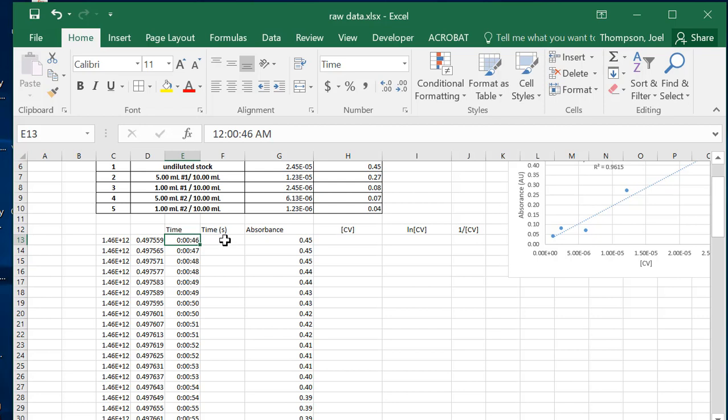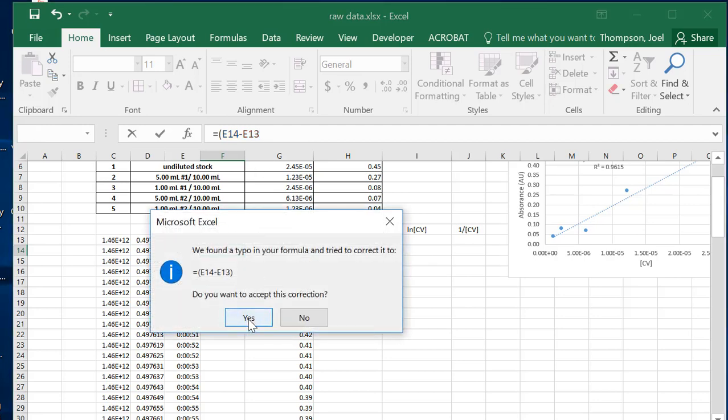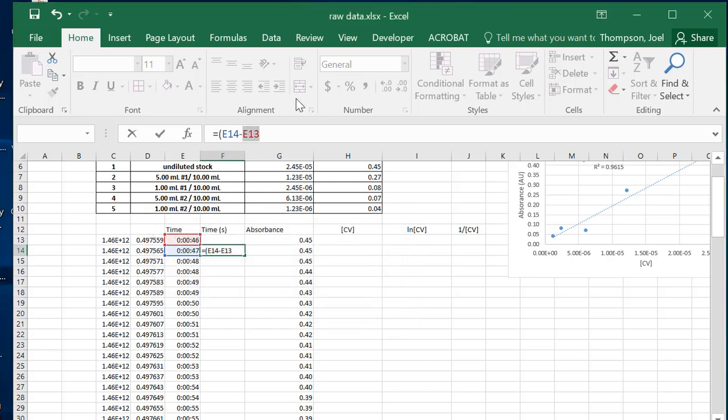So here's what I'm going to do. I'm going to subtract this time. This is a good trick, and you'll learn these things working with time in Excel. It's nice to know, especially if you want to watch elapsed time. I just want to know the difference. So in theory, from here to here, 1 second has elapsed. So I'm going to do the difference. See what I'm saying up here in my formula? The difference between here and here. Okay, there we go. And then I'm going to multiply it by that multiplier, 86,400. Let's see how this works. That's pretty good. That's roughly 1 second.